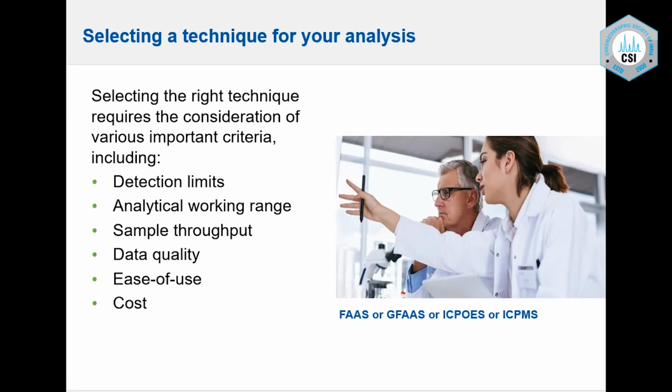Then selecting a technique for your analysis. When you go for analysis, whether it is FAAS, GFAAS, ICP-OES or ICP-MS, different criteria are involved in the selection. Detection limit: you need to see whether the detection limits are achievable on this technology or not. Analytical working range: you always prefer a higher analytical working range. If your sample contains lower and higher concentrations in a single sample, then you can do all these elements in a single run. Other than this, sample throughput is also very important, because if you have many samples and many elements to do in a short time, you should always prefer to do this analysis on a very fast system.